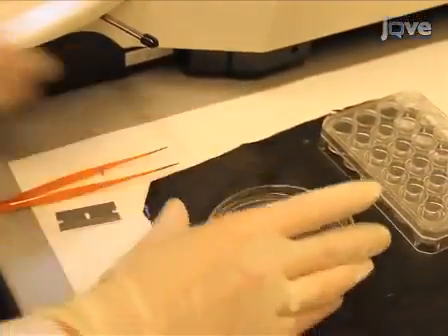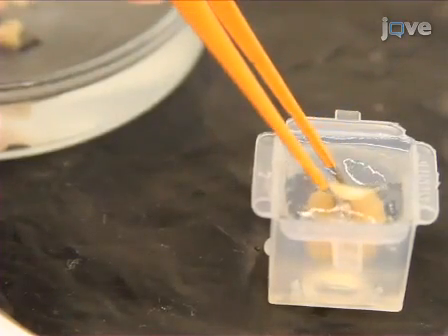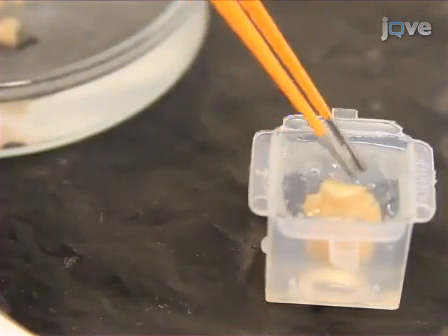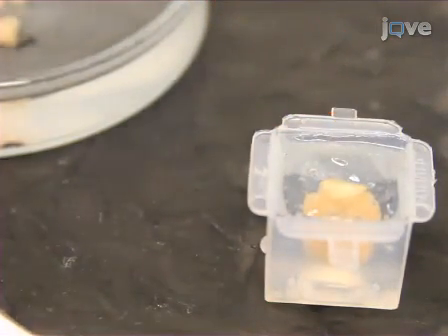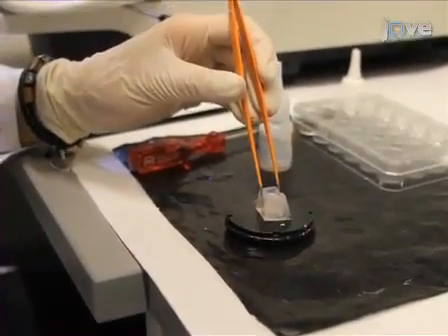The procedure begins by dissecting the fixed brain from an anesthetized perfused rat. Embed the brain in warm 5% agarose in a plastic mold. Orient the brain to the correct angle before the agarose sets solid. Mount the agarose block with the brain inside onto a sample holder.